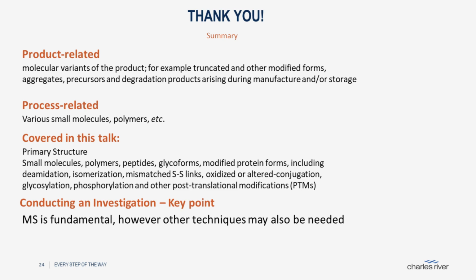So the last question for the presentation is, what are some major differences between ELISA and mass spec for HCP determination? Oh, good question. This has been a bit of a challenging area, I think, over the years, because they are so different. They've been called orthogonal or complementary. So ELISA is very quick to apply, obviously, and that's why it's very useful for like a QC or a rapid, maybe even a plate-based type of method, so you can get your answers very quickly.